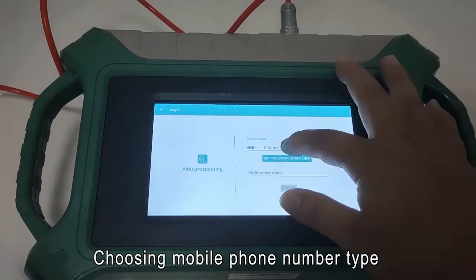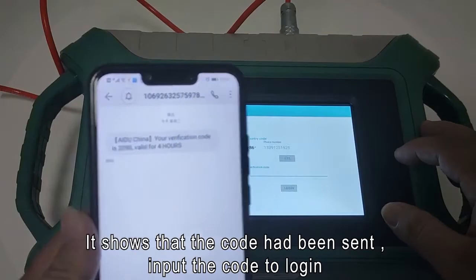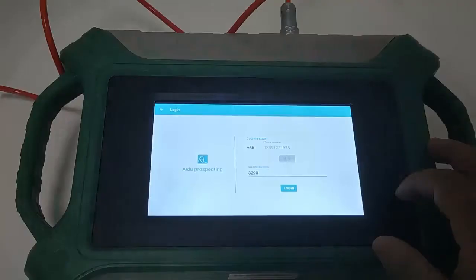Now we turn to the login interface. Choose a mobile phone number type, then input your number to get a verification code. It shows that the code has been sent. Input the code to login.